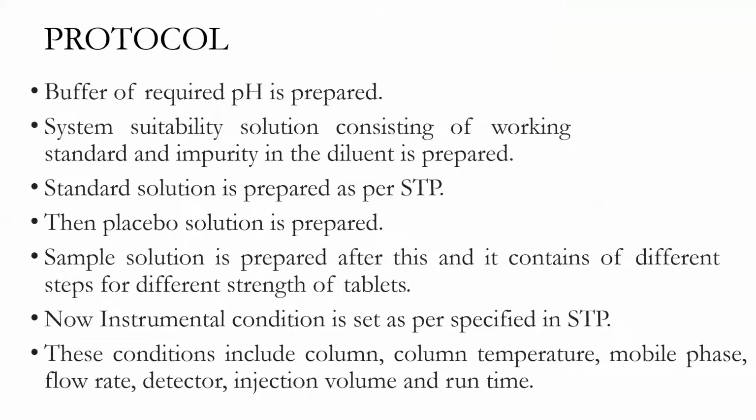This contains different steps for different strengths of tablet because it is specific for every drug or every tablet. So this cannot be shown here. This is as per the standard procedure. Whatever it is, like you are going for paracetamol, you are going for ranitidine, etc., then you have to follow that STP only.